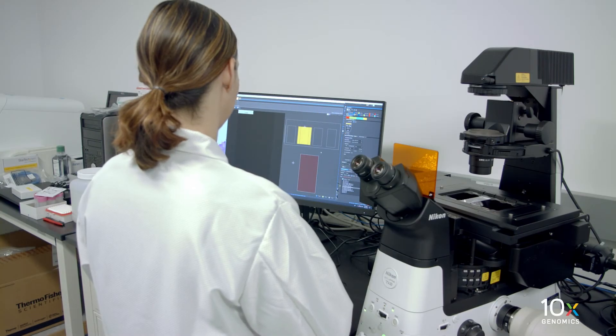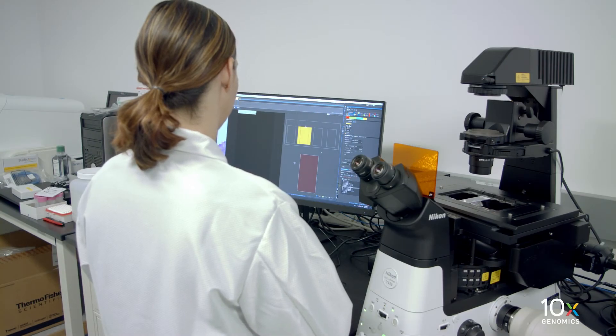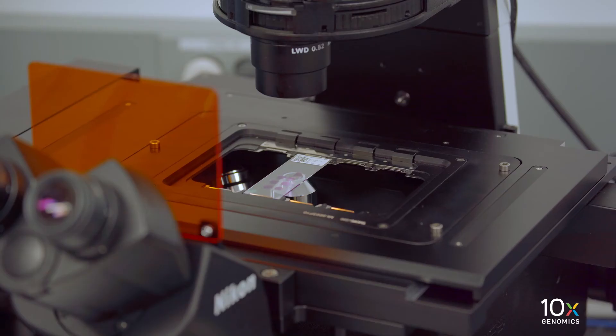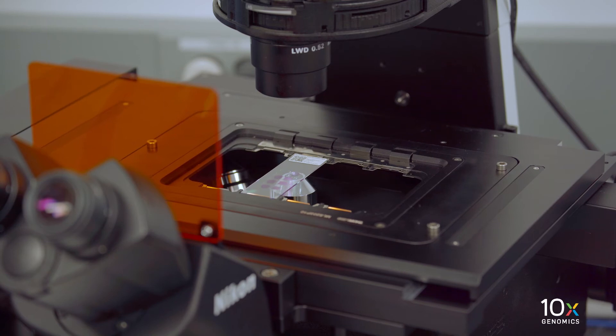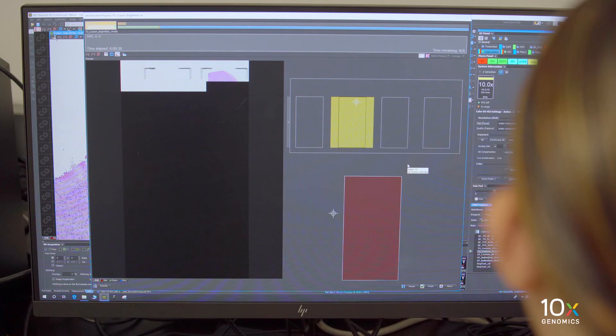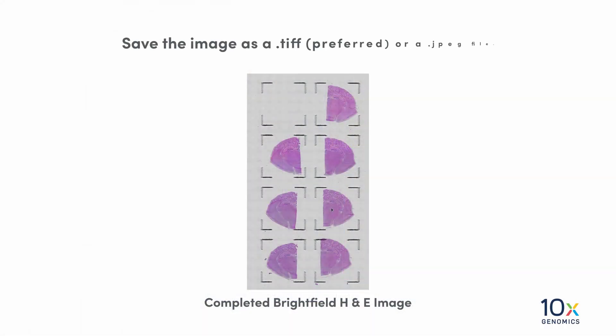Hit play to begin imaging. We will image all eight capture areas at the desired magnification using Brightfield imaging settings.